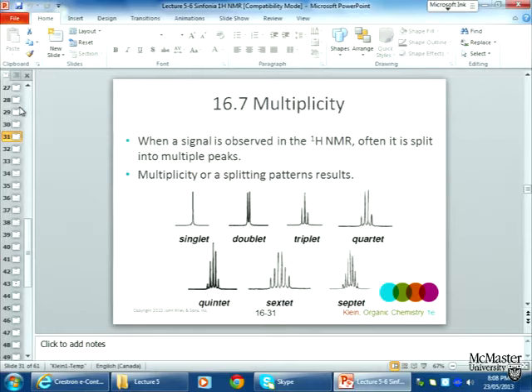In NMR, we're not really looking at the oxygen at all in the carbonyl group, but we can see indirectly the presence of a carbonyl because carbon-13 nuclei doubly bonded to oxygen have characteristic chemical shifts, 175 to 200 ppm, depending on whether you have an ester, amide, ketone, and so on. But we can indirectly determine the presence of a carbonyl group.